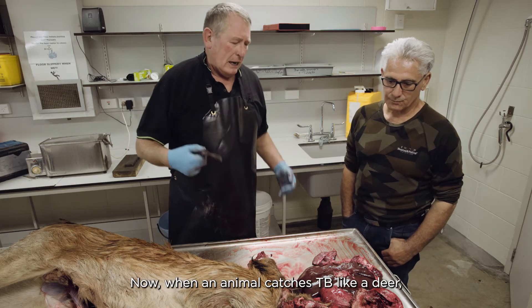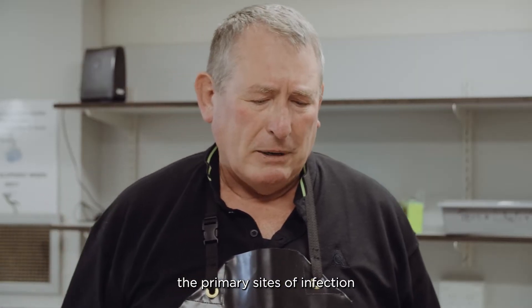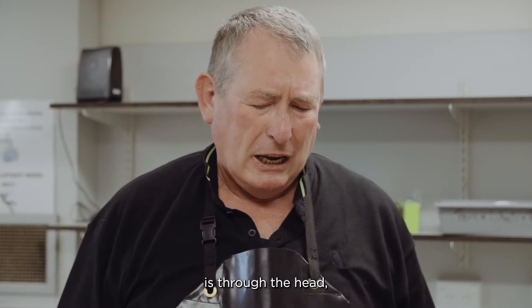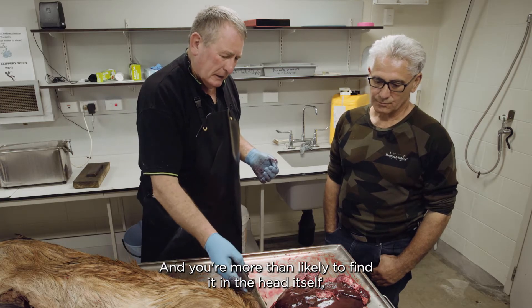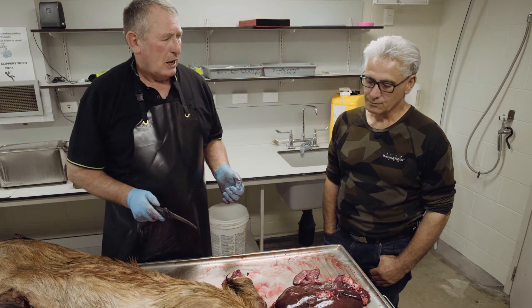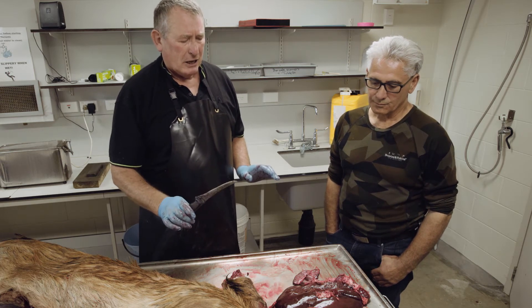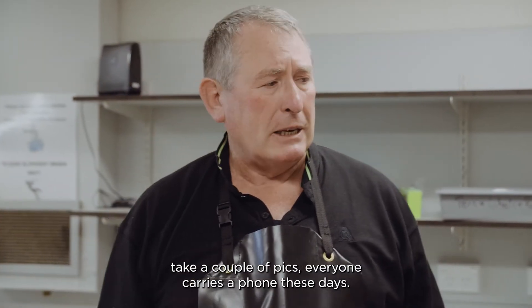When an animal catches TB like a deer, the primary sites of infection are through the head - you're more than likely to find it in the head itself, in the glands, or in the lungs. Those are the main spots. So if you're going to have a quick look, those are the places to look. If you find something, stop and take some photos.